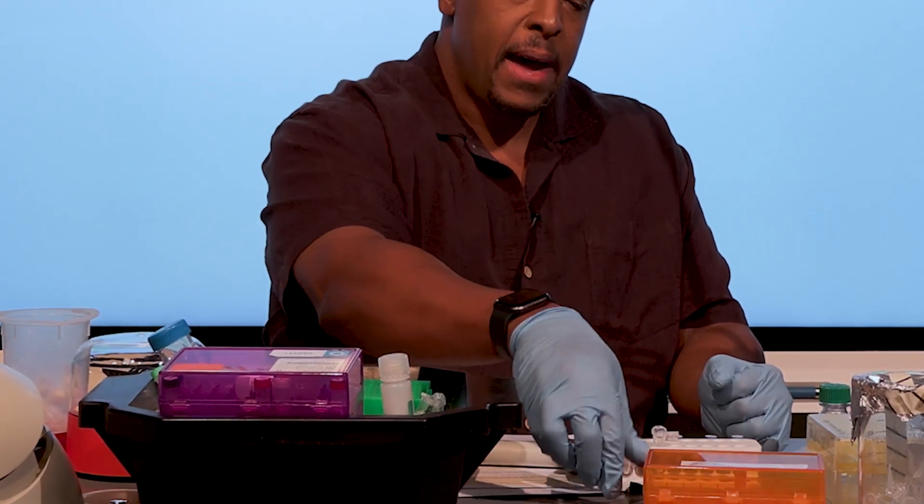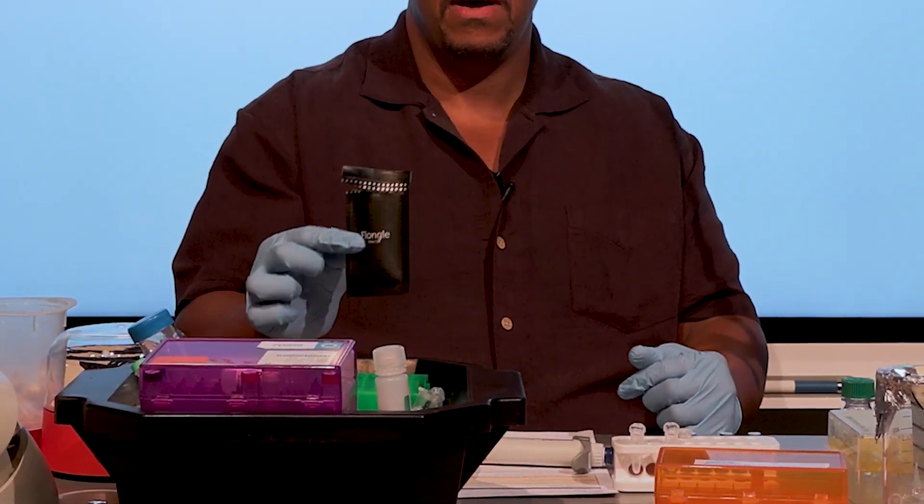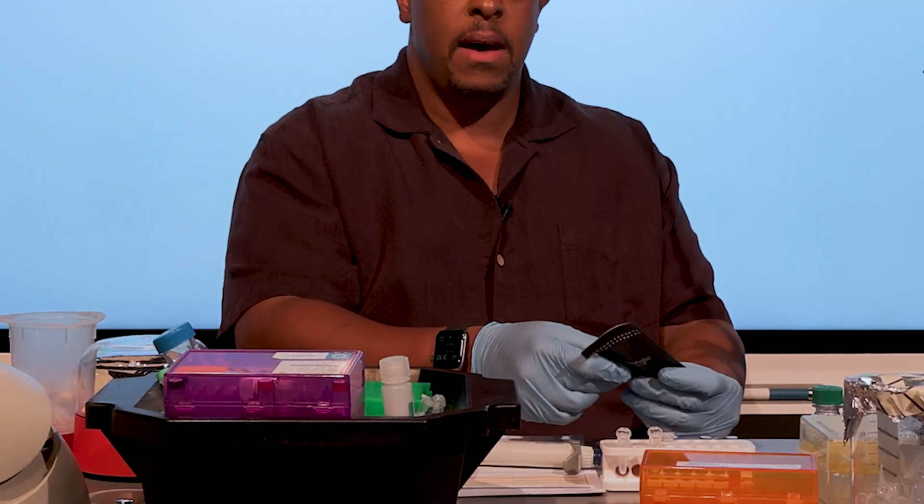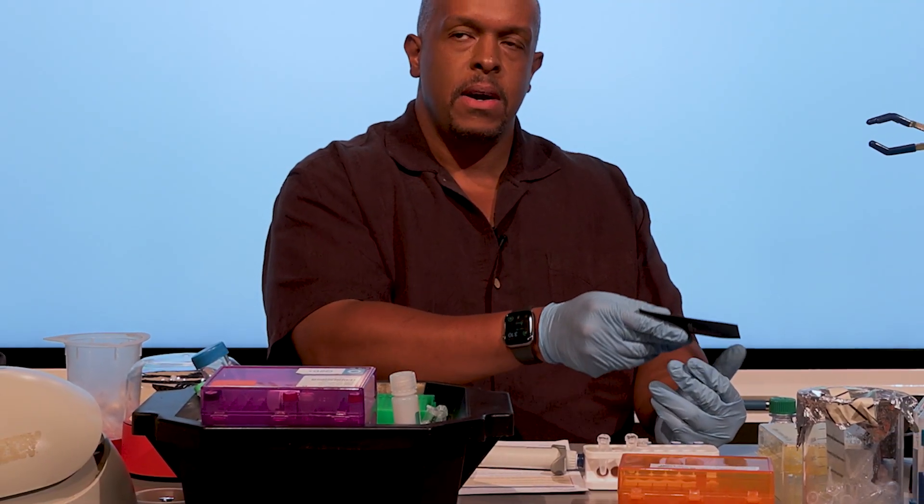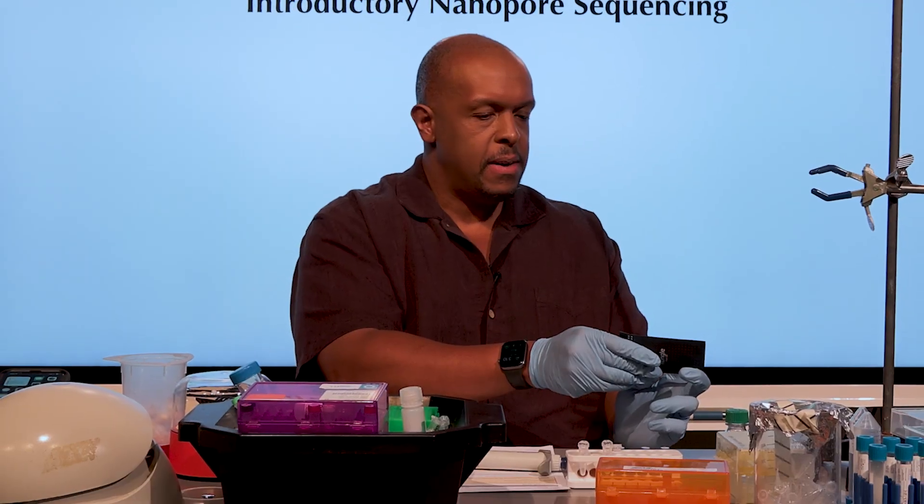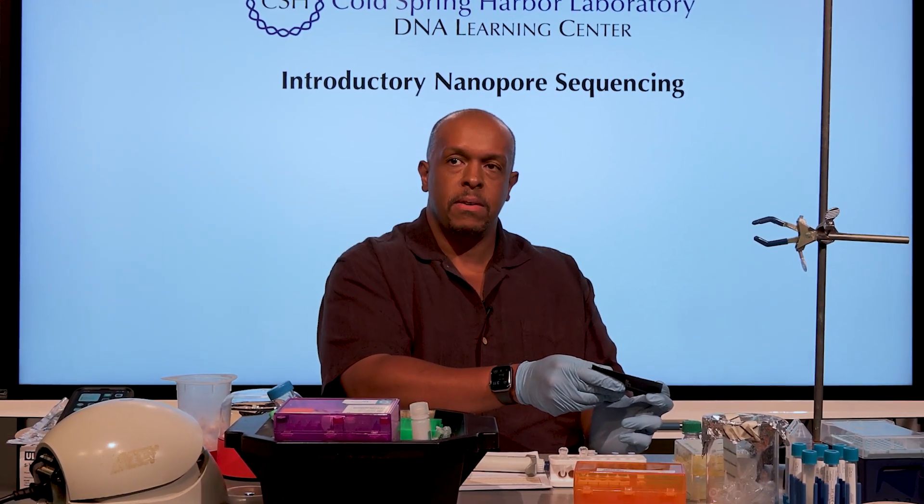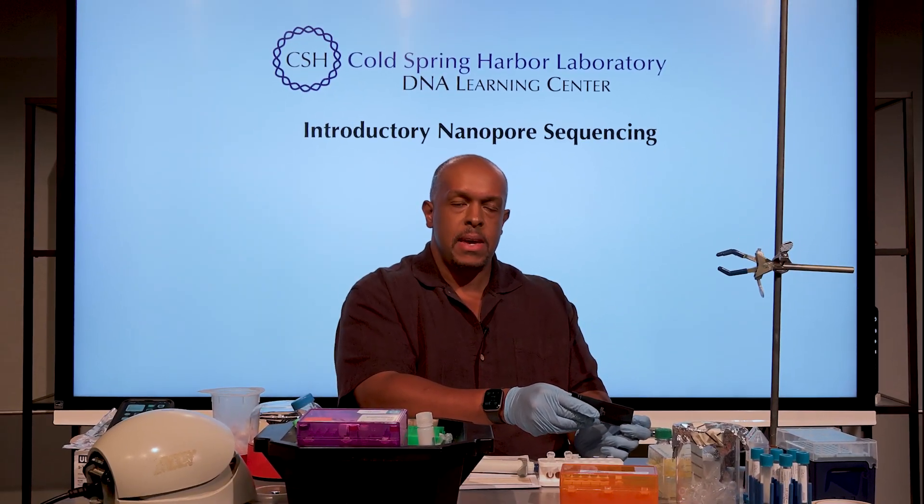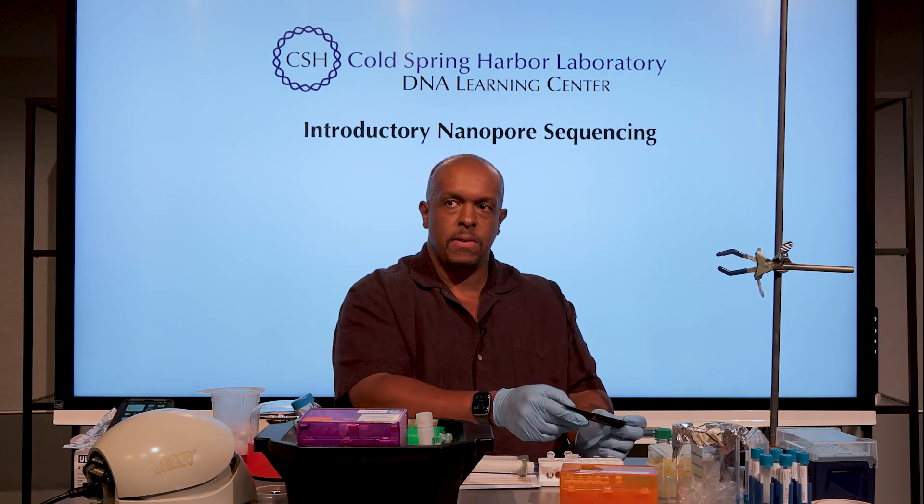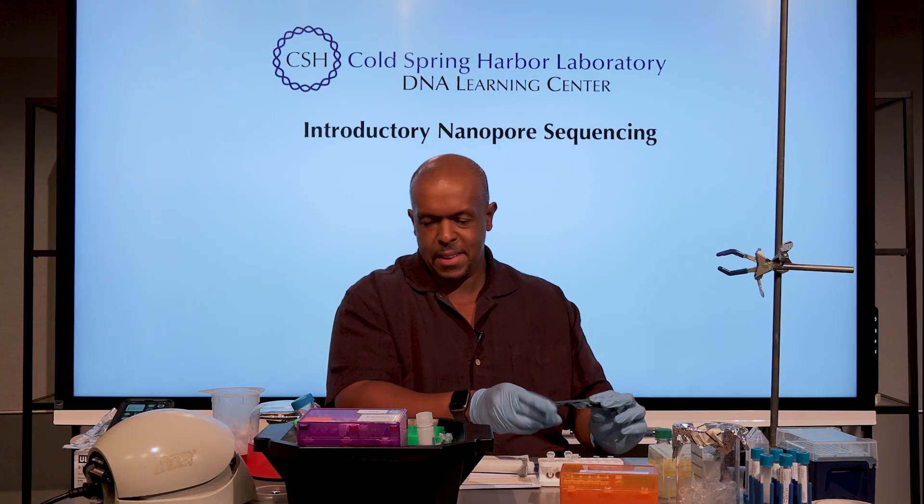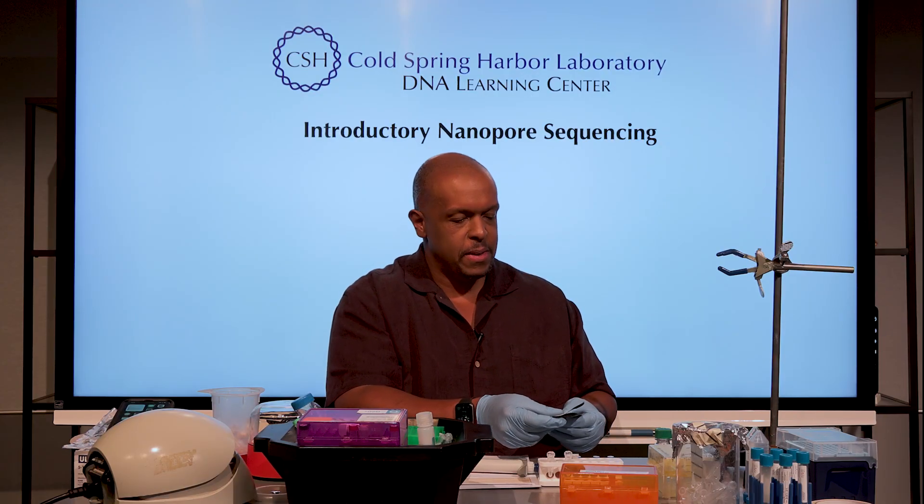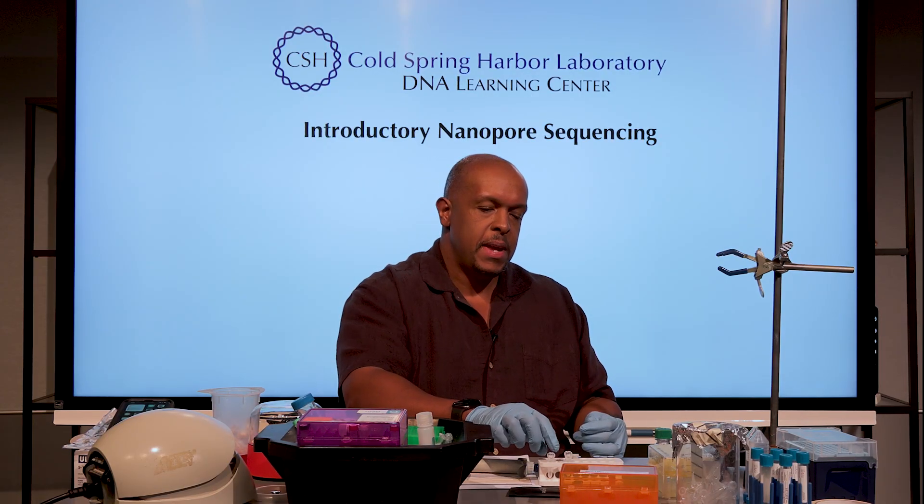So you'll have a flow cell expansion pack. You're going to have a flow cell that's been checked, and it's very important to verify on the back what type of flow cell this is—the product code. You're going to need that. And also, if the product code does not match with the kit, then you'll get zero sequencing. So make sure that you're using the right flow cell.